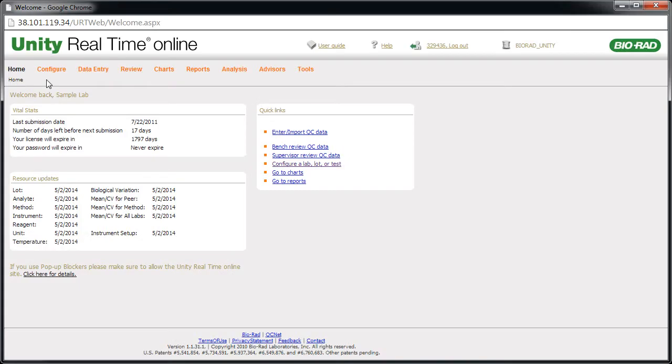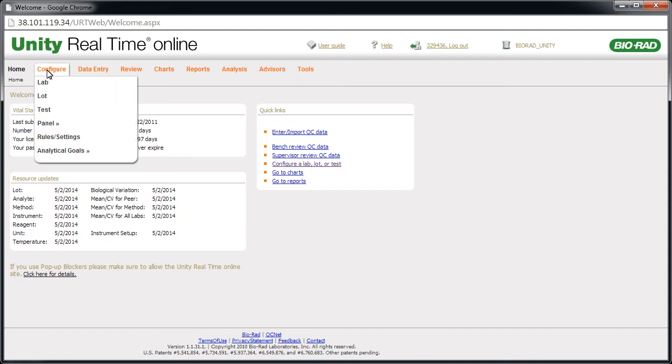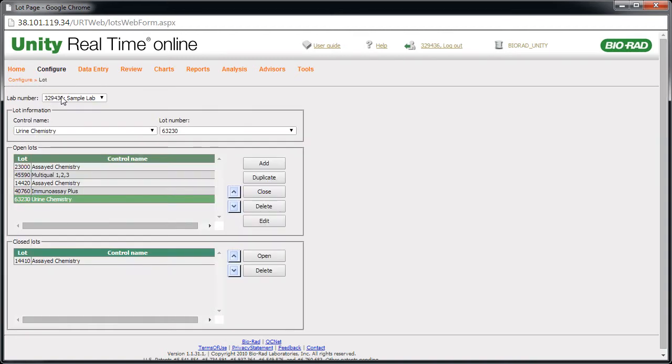Duplication copies test settings and rule selections to the new lot. To add a lot, point to Configure and click Lot. Select the control name.